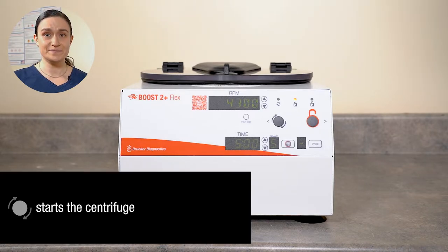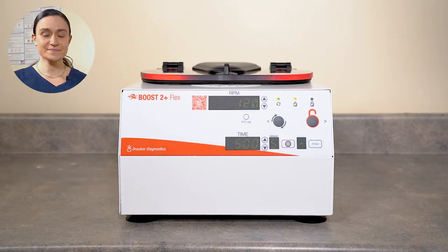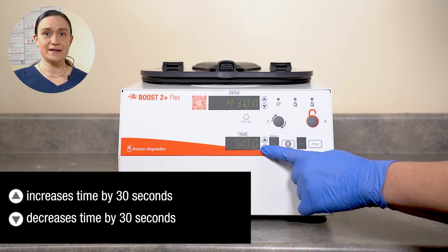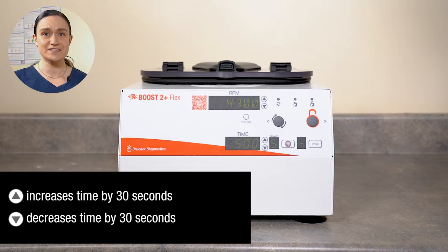Next, we have our Start button. This button will start a cycle with the currently selected settings. Next, we have the Time screen. This screen shows the currently selected runtime in minutes and seconds. You can adjust it using the arrows to the right. A single press up will increase by 30 seconds, and a single press down will decrease by 30 seconds.